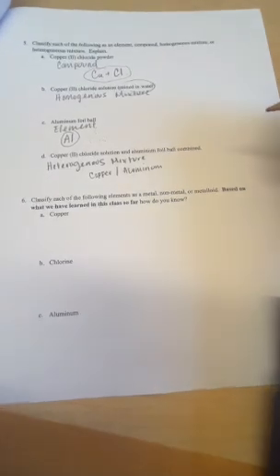So copper chloride solution and aluminum foil ball, we're going to call this a heterogeneous mixture. We're going to go with that because, you know, at the end of this experiment, you could see pieces of copper and aluminum, or at least we can assume that's what those are.